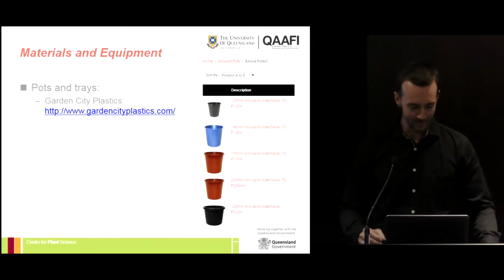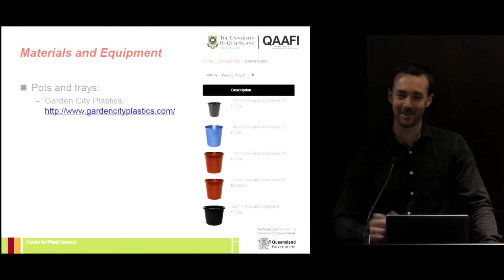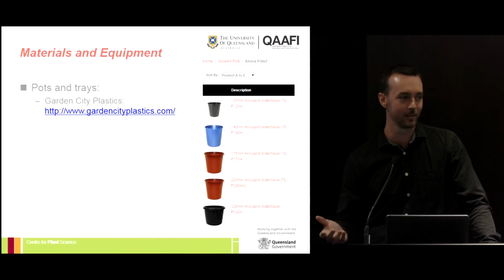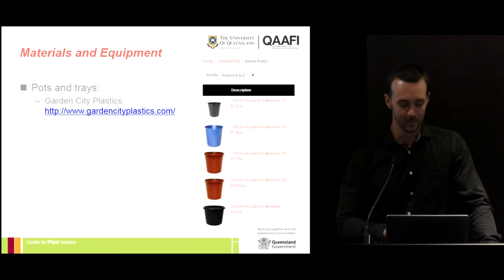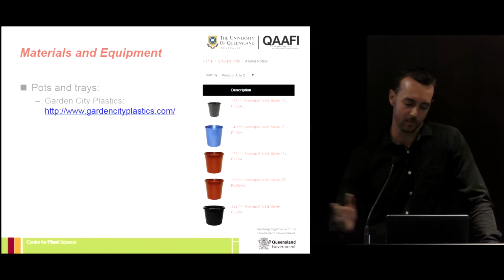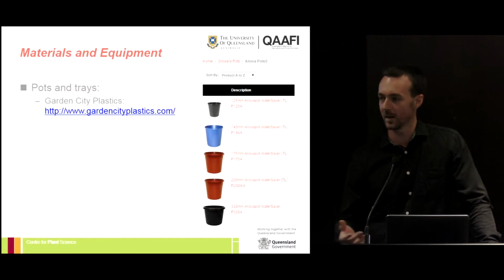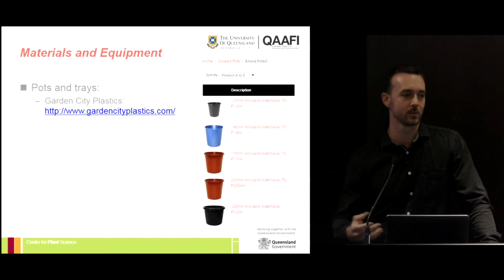So, yep. I guess to dive a little bit more into the details about what we use and how we do it. We get most of our pots and equipment from this company in Australia. I'm not a shareholder of the company, but if you're interested in looking at the sort of stuff, I'm sure you can find another supplier or another company in your home country. So Garden City Plastics, and they have all these Anova pots. I'm sure it's just the way we have the setup in our glass house. These work well, but I'm sure you can work out different watering systems and pots that you can use.